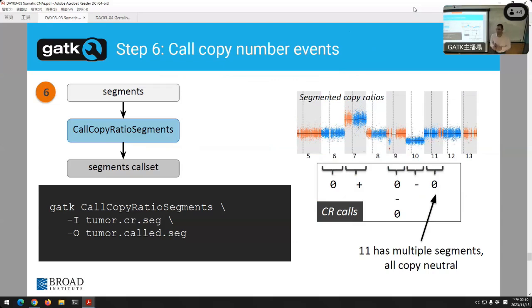So, don't mind me. Ultimately, though, with copy number, you don't expect that many. It's not like you expect billions and millions of copy number events in a tumor anyway. So none of these files get particularly massive.